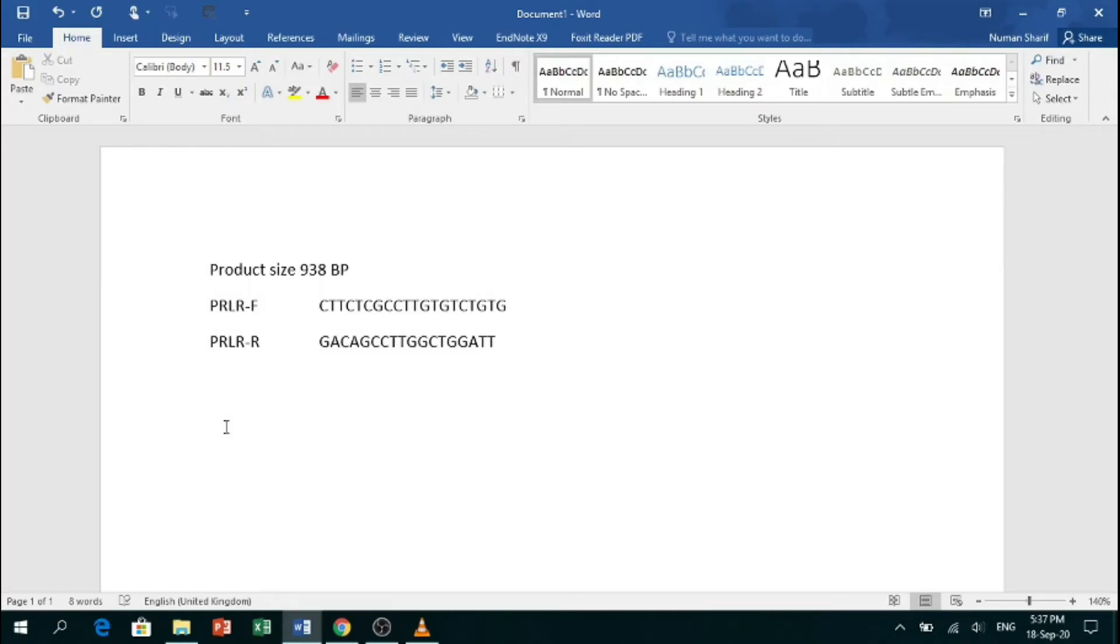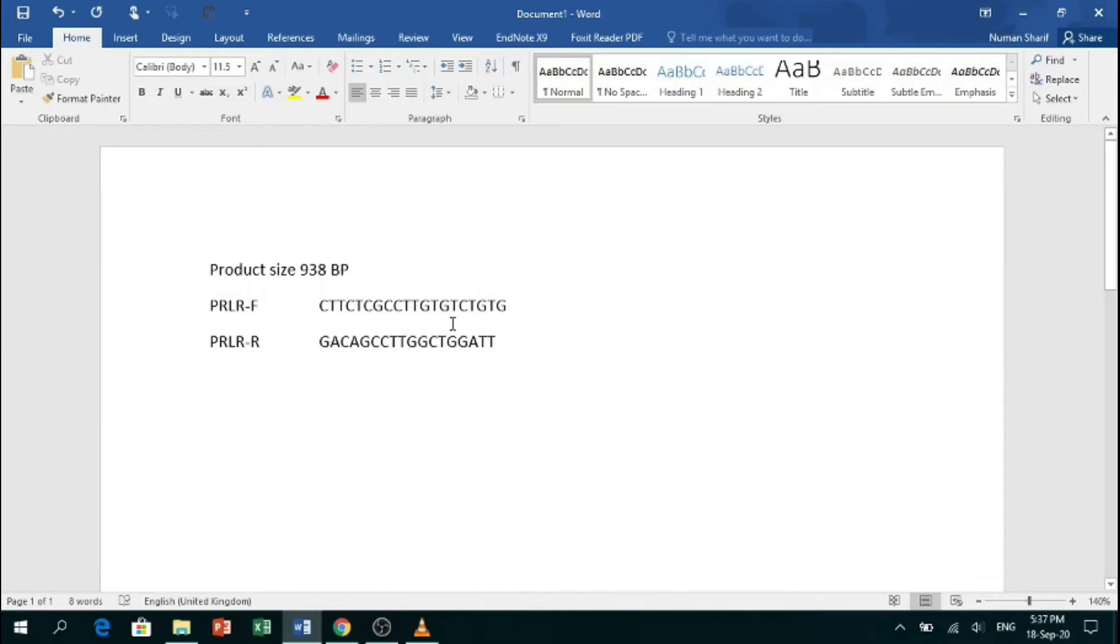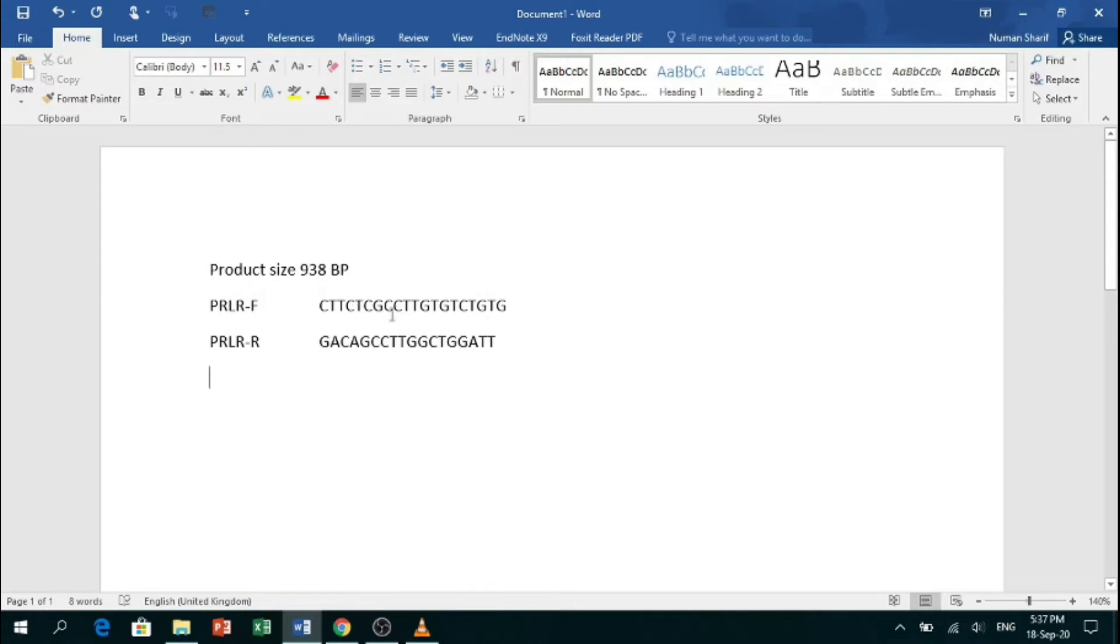Hello, in this video I will show you how to check the specificity of primers. Before moving on, let me introduce you to what primers are. Primers are short nucleic acid sequences which provide a starting point for DNA synthesis.